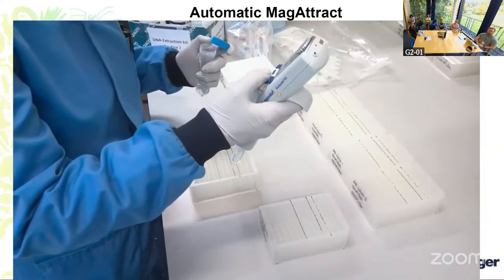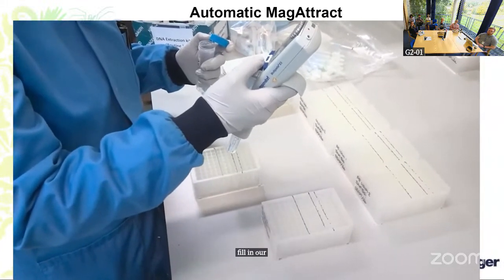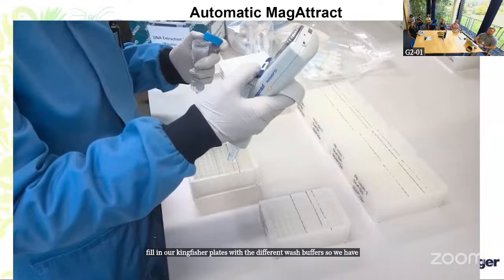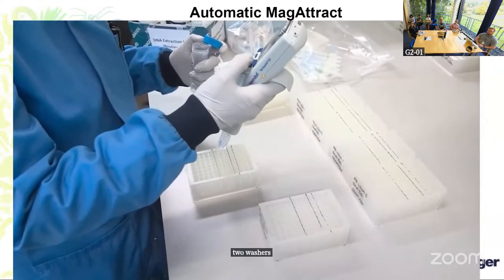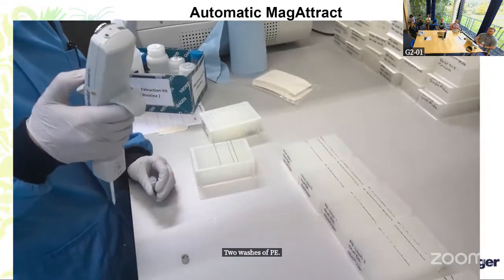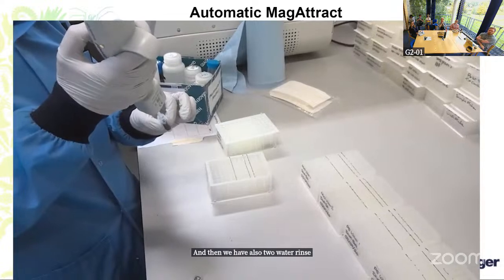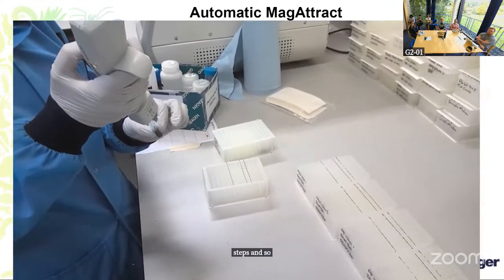While samples are lysing, we can also fill in our KingFisher plates with the different wash buffers. So we have 2 washes of MW1, 2 washes of PE, and then we also have 2 water rinse steps. And so we prepare those in advance.